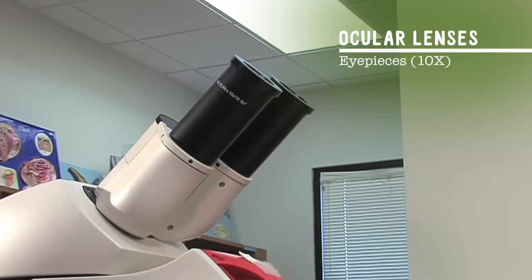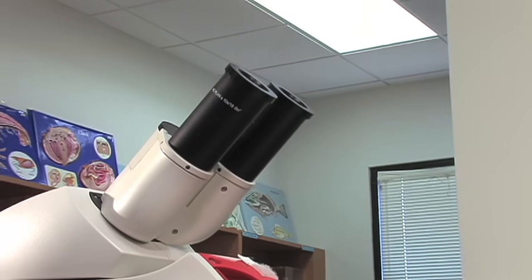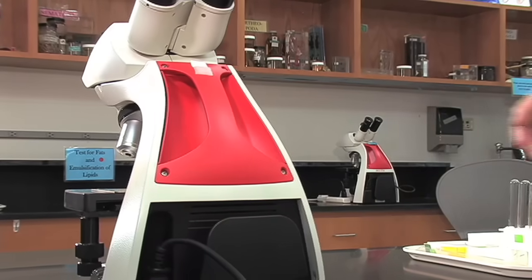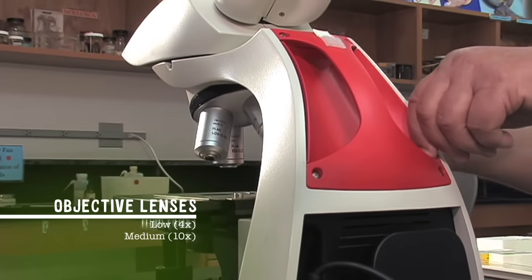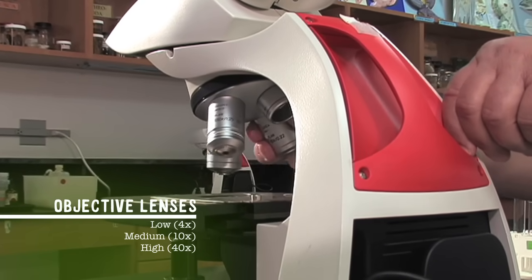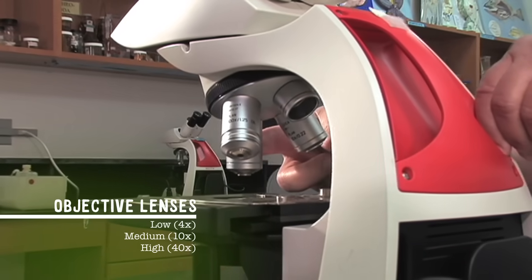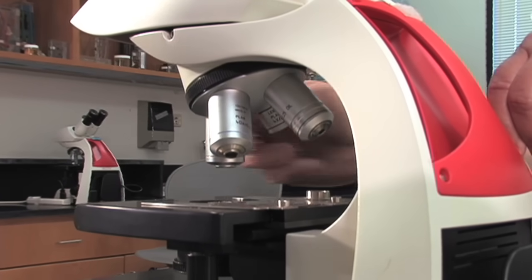At the top of the microscope are the eyepieces or oculars. These magnify our specimen 10 times. The second set of lenses are down here — these are the objective lenses. The short one is the 4x lens. The next one is the 10x lens or medium power. And the next one is the 40x lens or high power. They're mounted on the revolving nosepiece, which lets you change them easily.